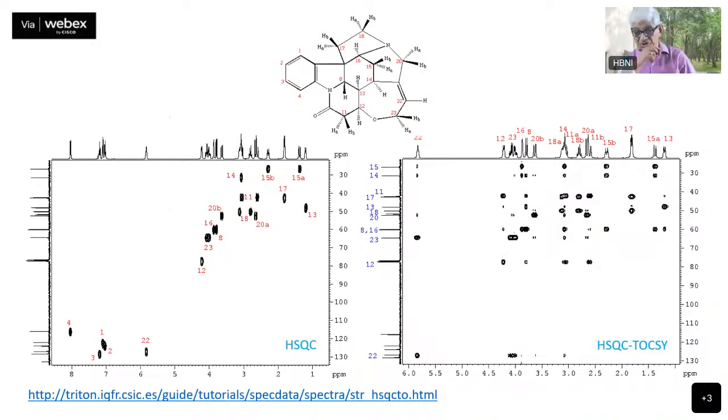Okay, here is an illustration of the experimental spectrum. In fact, these examples can be discussed in more detail in practical classes, so that someone can go through it in greater detail. So here is the HSQC spectrum of this particular molecule. So you see so many peaks are there. This is the one-dimensional proton spectrum on the top, and on this axis you have the fully decoupled carbon-13 spectrum. Okay, this is a carbon-13 spectrum, fully decoupled. It's all singlets. Various carbons are there. You have so many carbons, and all those carbons are represented here.